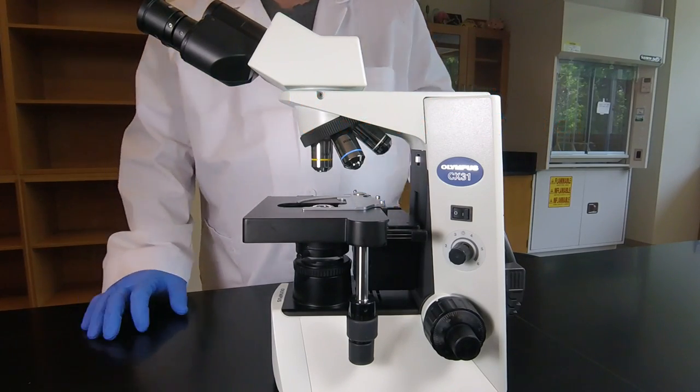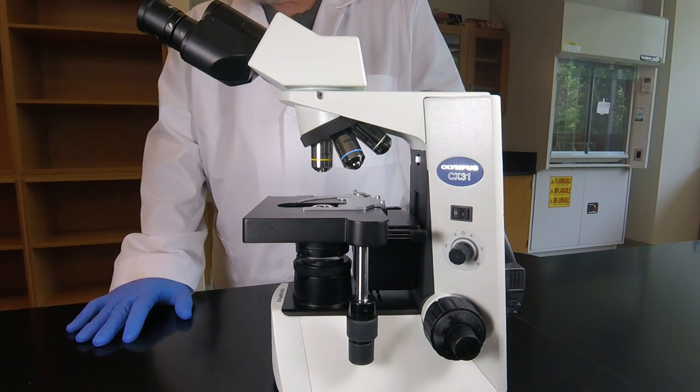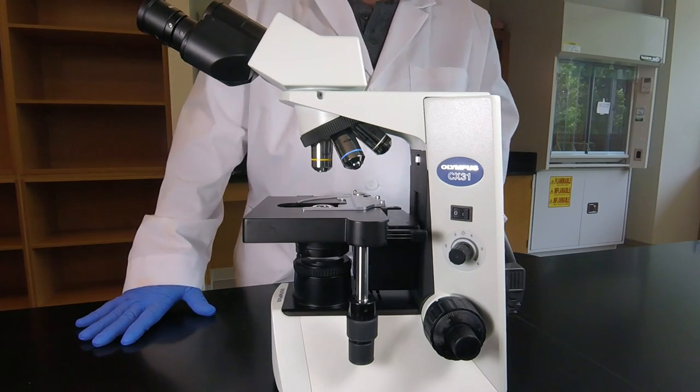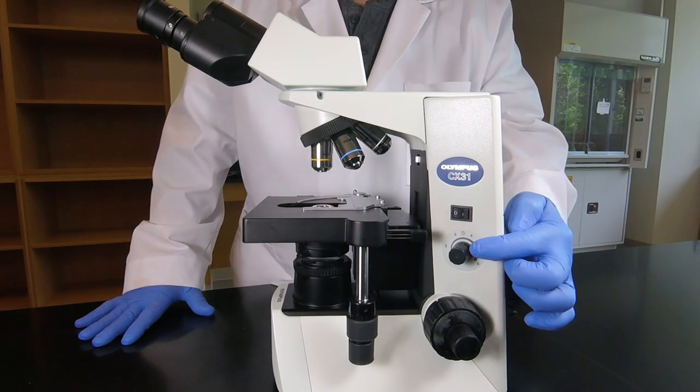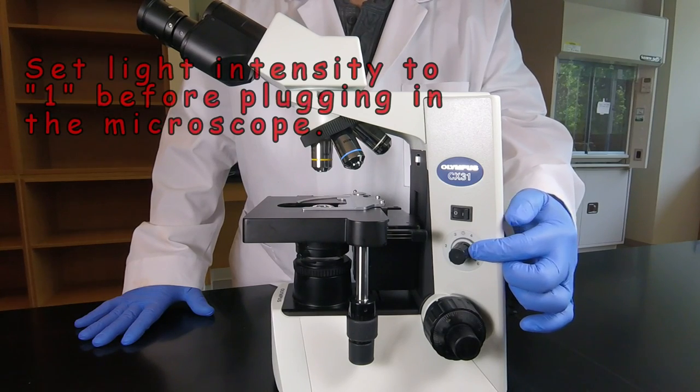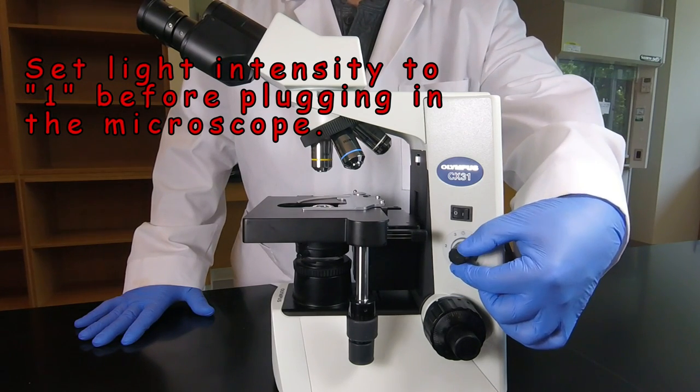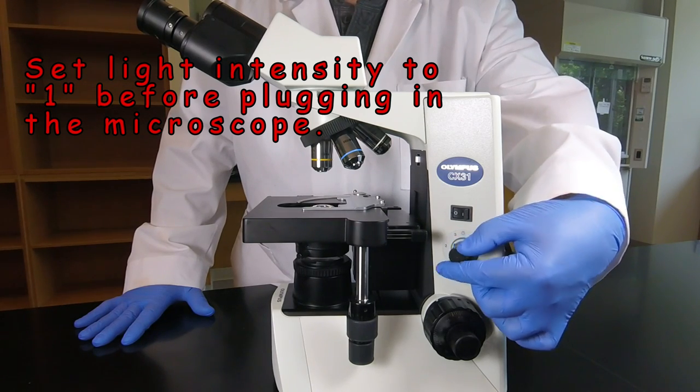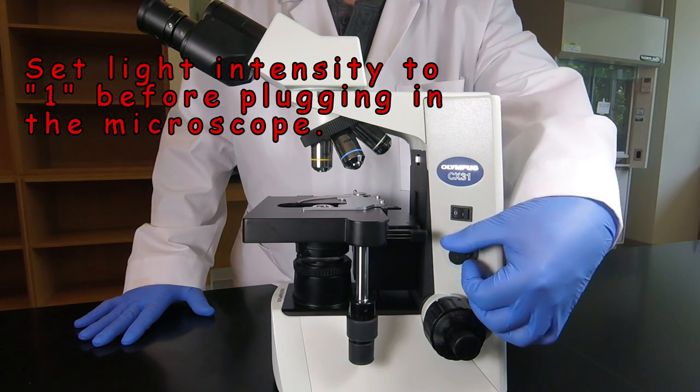Now, once your microscope is in position, we want to be able to plug it in, but there's a preliminary step we do before we plug it in. First of all, we want to check the light intensity control knob, which we see right here, and make sure that is set on one, as low as it'll go. If it's not set at one, then put it back to one.